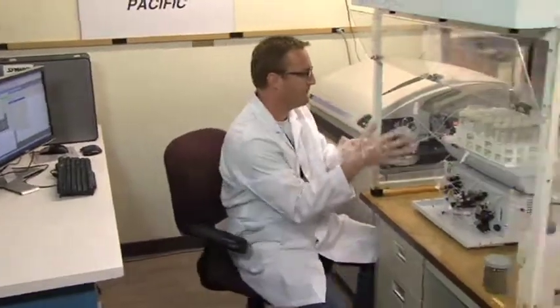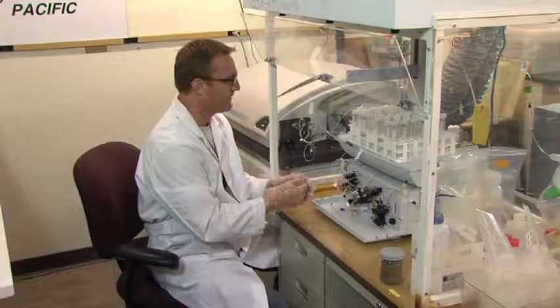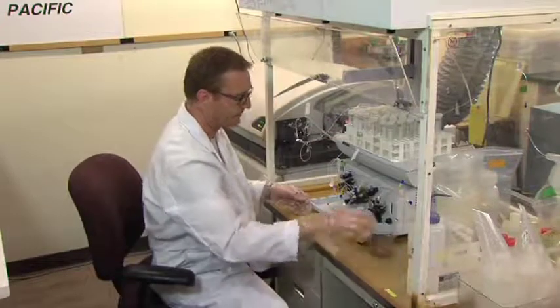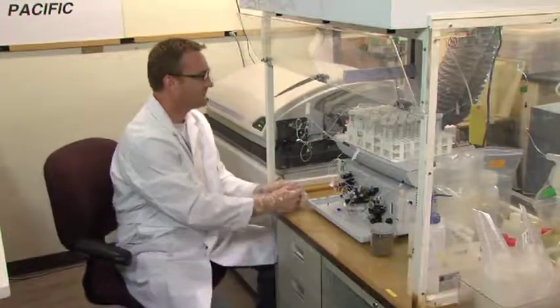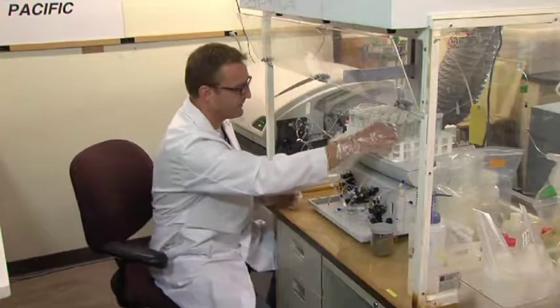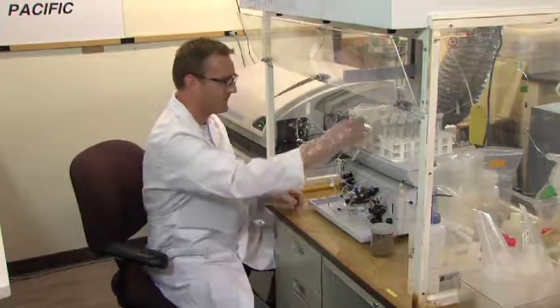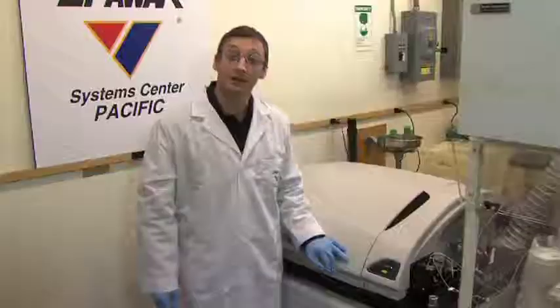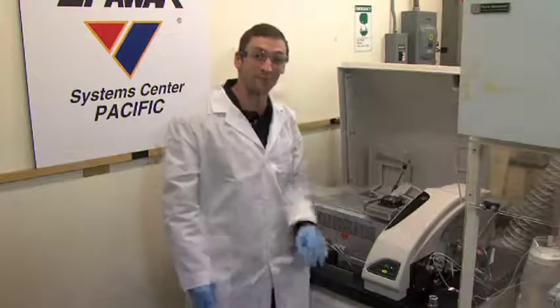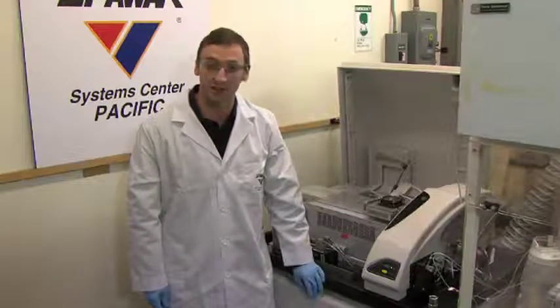Other instruments that could be used to analyze for lead are ICP atomic emissions, atomic absorption known as AA, or graphite furnace atomic absorption known as GFAA. AA and GFAA are older technologies that can analyze for only one metal at a time. They can be economical if only one metal is being analyzed for. In an ICP-MS, all metals can be detected simultaneously in one analytical run. They can be the best analysis instrument to use for samples that are being analyzed for several metals.